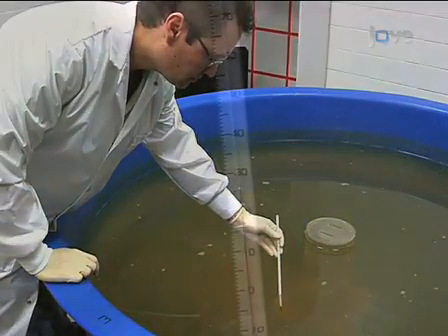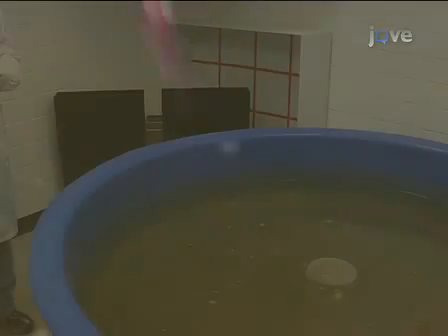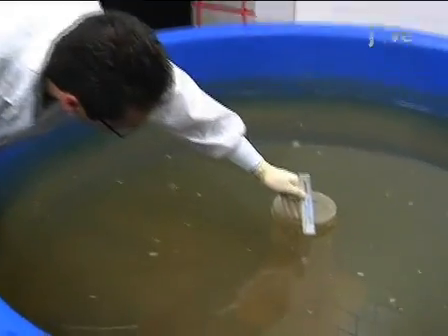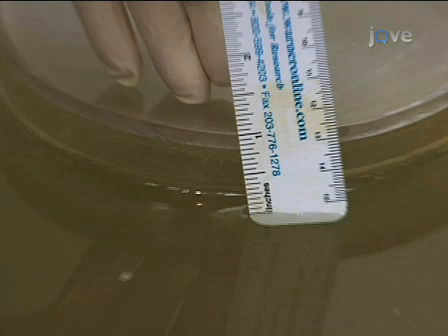Periodically check the water temperature so it's plus or minus one degree of 26 degrees Celsius. Place the escape platform in the center of the pool. During training, it can be exposed about one inch above the water. This teaches the rat there is a platform and that is the way to get out of the water.